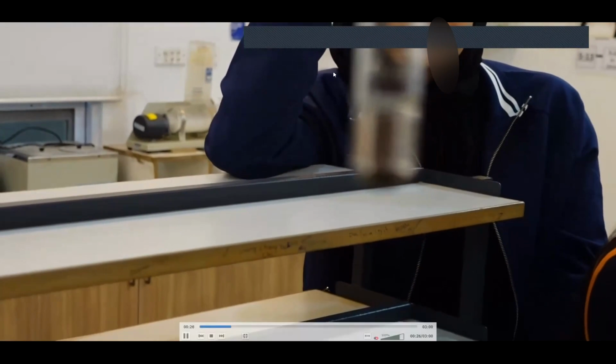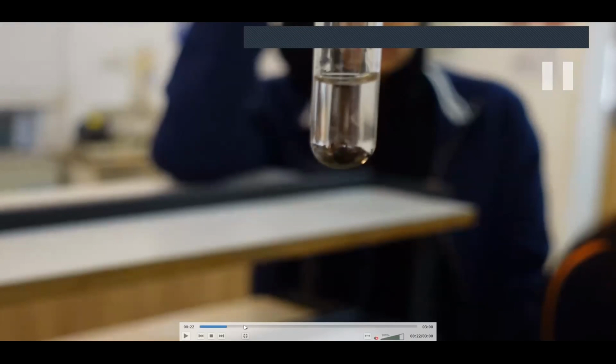Do you see anything here? Any bubbles? Black ribbon of magnesium. There are some small bubbles if you notice. थोड़े से bubbles आ रहे होंगे. थोड़े से.